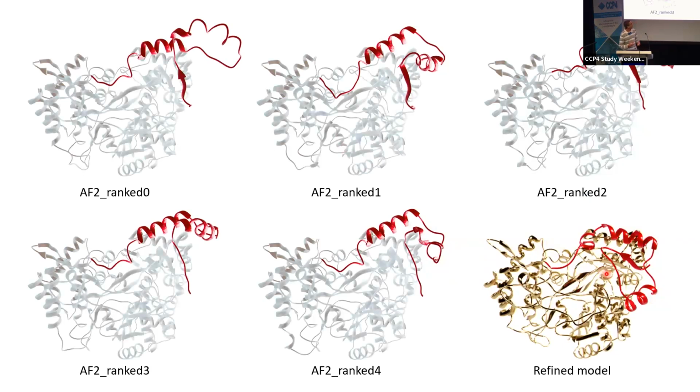And the core is actually similar to the other structures in the PDB. But the different part that is in red is actually the important part, at least biologically important for this structure, at least for us. And you can see that it wasn't predicted properly, like here. Coming back to what Dorothy has said, AlphaFold is extremely good, but you shouldn't have 100% confidence in your model. You do need experimental data.